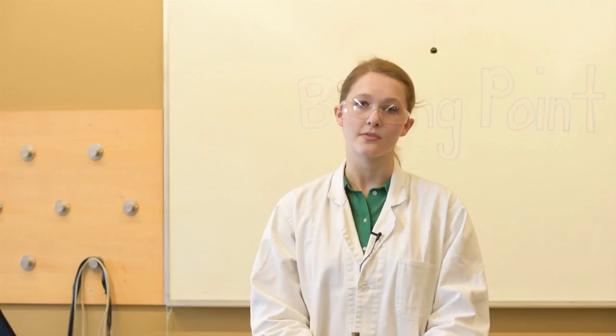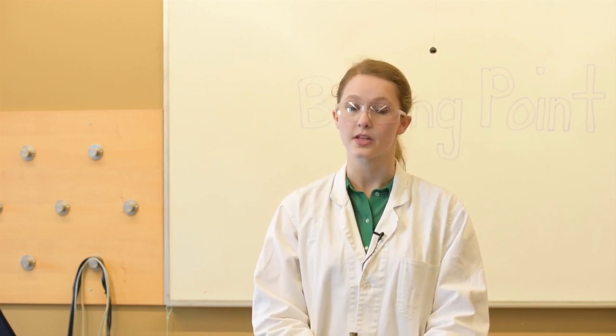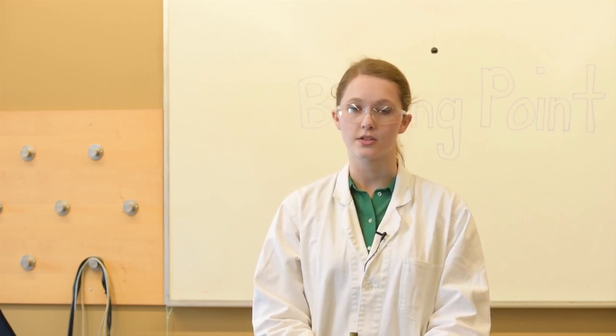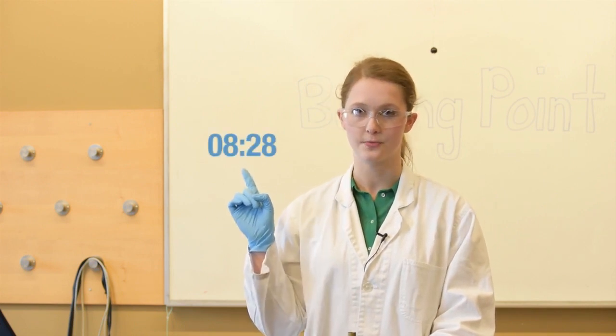I understand that many of you do not have a lot of experience working with a Bunsen burner. I'm now just going to take a few moments to talk about some of the key features on a Bunsen burner, as well as methods for safe handling. If you feel comfortable with the Bunsen burner, please skip forward past this part of the video.